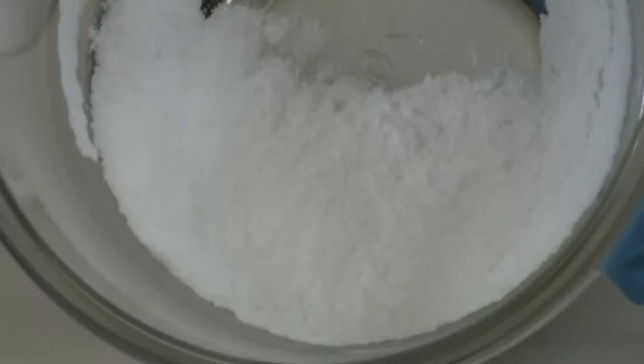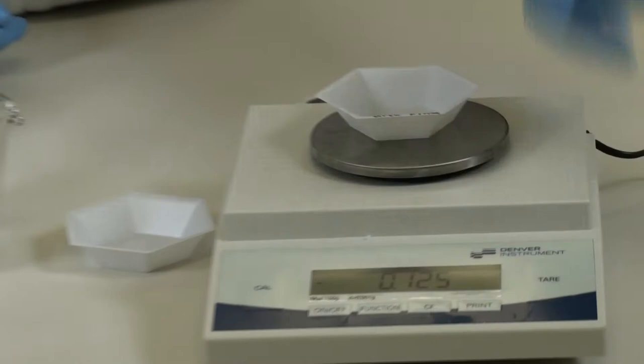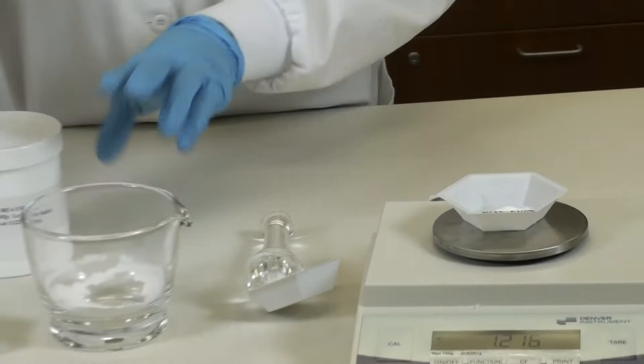Now, you want to go ahead and weigh the required amount in your prescription. So tare a medium-sized weigh boat and weigh the required amount of fine powder. Return the excess powder to the supply station.